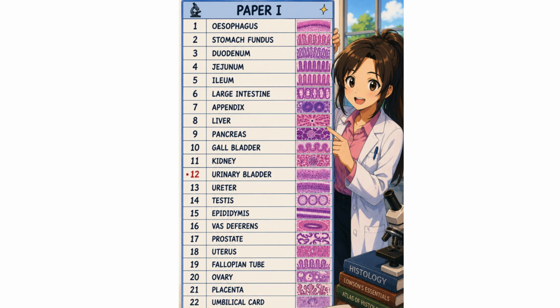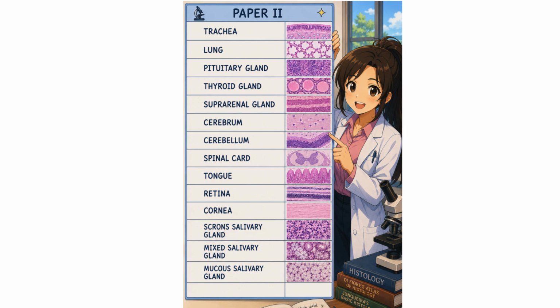You have a thick muscularis layer, that is your detrusor, with three ill-defined layers, and you have folded mucosa when empty. Urinary bladder is empty. Coming to trachea, that is your respiratory system. Trachea: C-shaped hyaline cartilaginous ring is the key identification feature, and it is lined by pseudostratified ciliated columnar epithelium with goblet cells. You also have to know other respiratory cells, and trachealis muscle is on the posterior side.